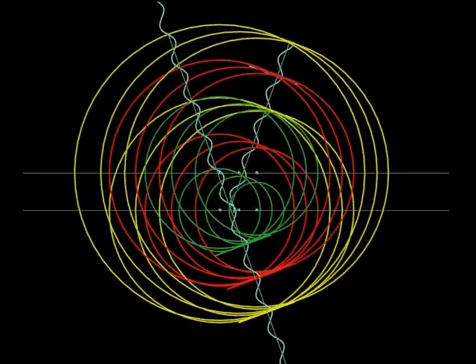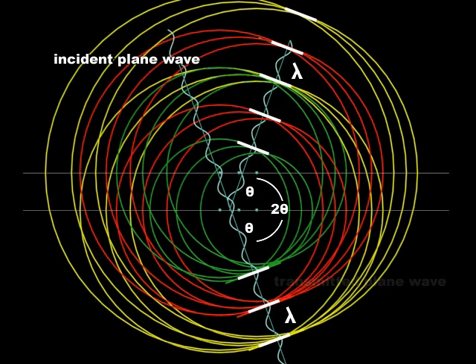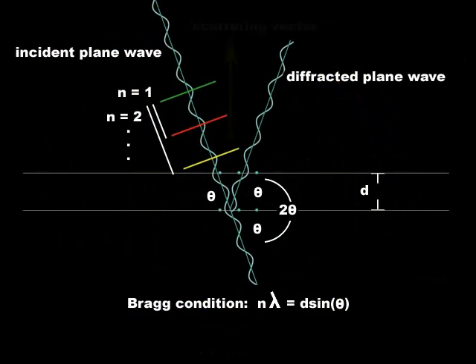Each atom radiates isotropically, giving off spherical wavefronts with wavelength lambda like ripples in a pool. Notice, however, that these scattered waves only overlap in 2 very special directions, along the transmitted and reflected beams. If we were to change d, lambda, or theta independently, the scattered waves would be out of phase and diffraction would not occur. Here is the relation shown explicitly.